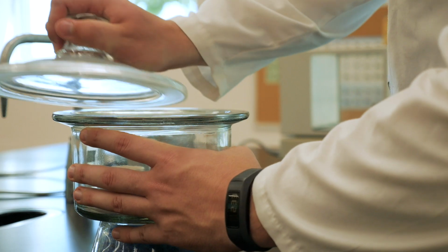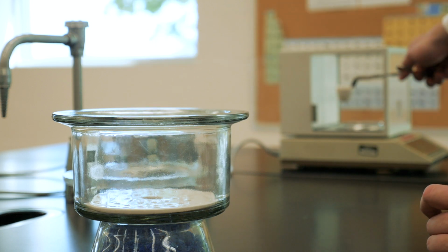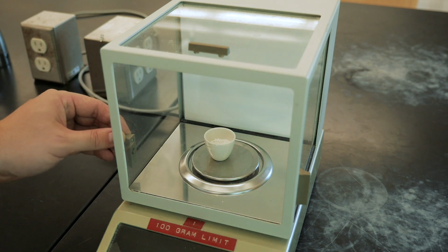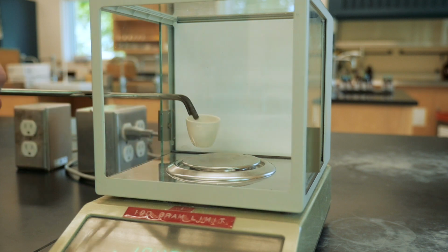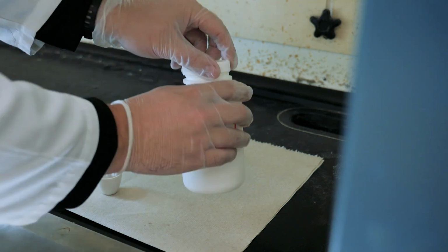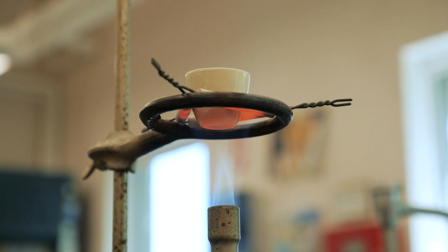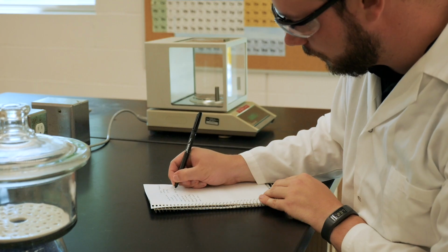Now that your sample is dry, reweigh it on an analytical balance to get the precise mass of the dry calcium sulfate. You'll use this mass to calculate the weight loss due to heating, and that should be all you need to count the water molecules that you had in your sample originally. Be sure to dispose of your sample in the waste container located in the fume hood, and then repeat the whole procedure, except for drying the crucible, with a second sample of gypsum. Any good experimentalist repeats their measurements to ensure that they are reproducible.